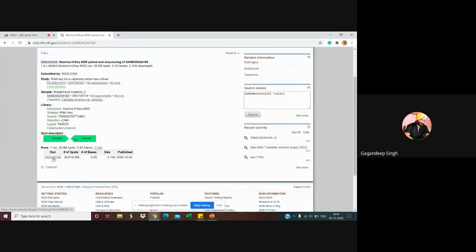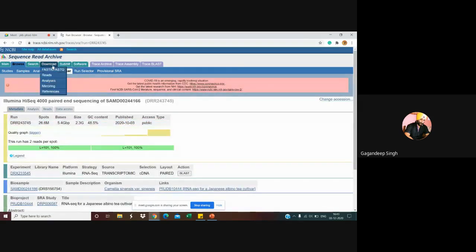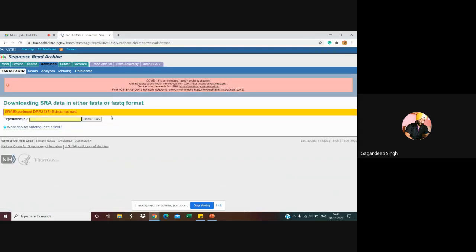This is the problem. Click, copy this run. This is what we copied. No problem. Click on this. Show runs. Not coming. Again back.